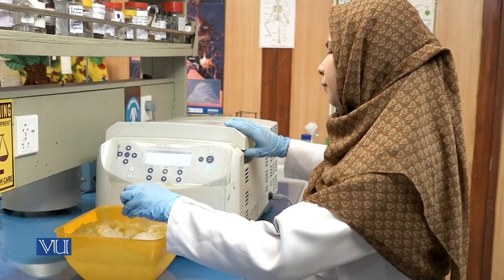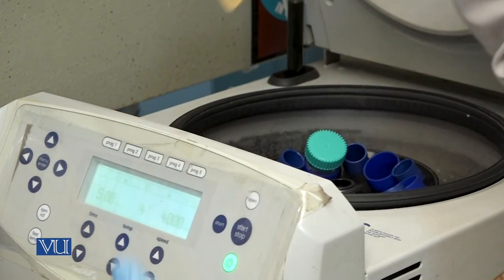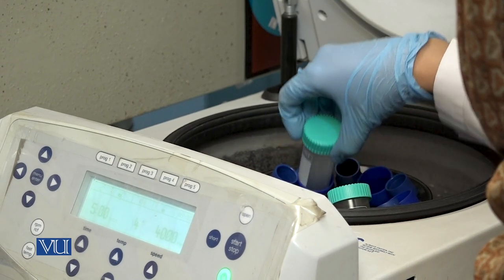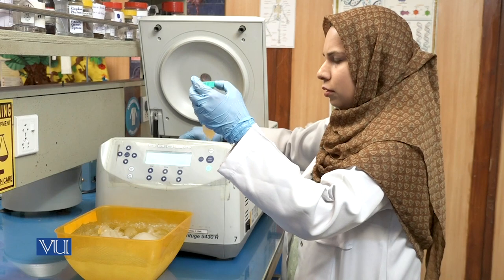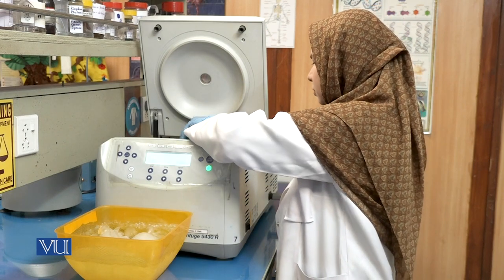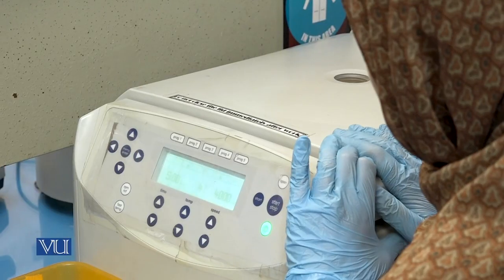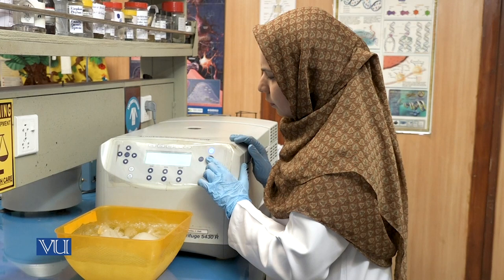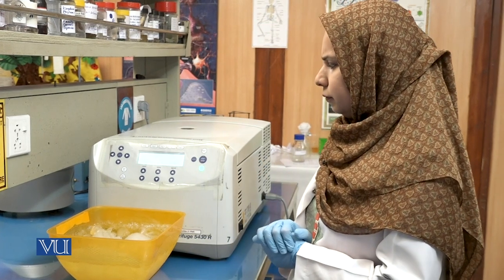As you know, when we use a centrifuge machine, we need to put the tubes always in a balance. So to balance the culture, I have put a balancer. And start the machine.